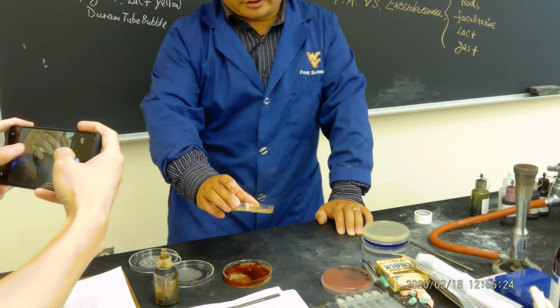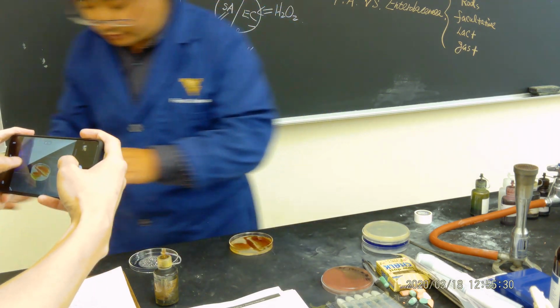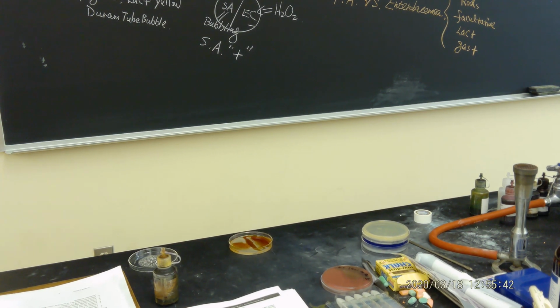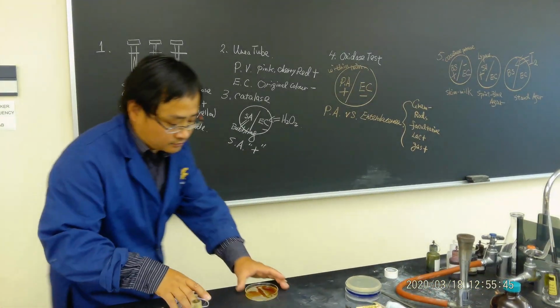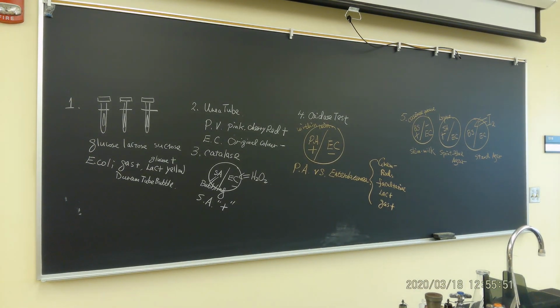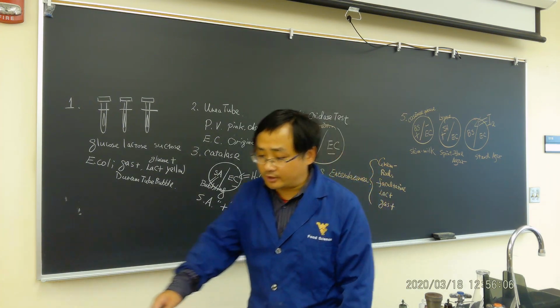Now, not very obvious. I don't know, maybe it's old. So this one I can return back to you. You can take a look, which side turns brownish, which side is not. You actually can pretty much see that. That turns brownish, this is like steel black. So which side shows brownish? E. coli side, is that right? E. coli side you can see a brownish color.